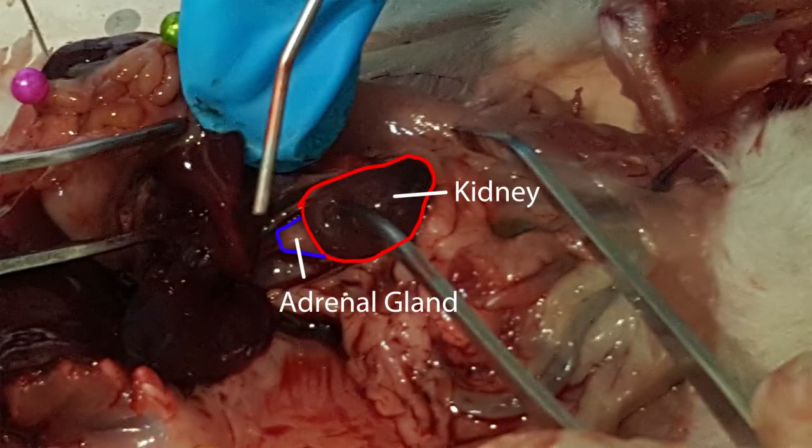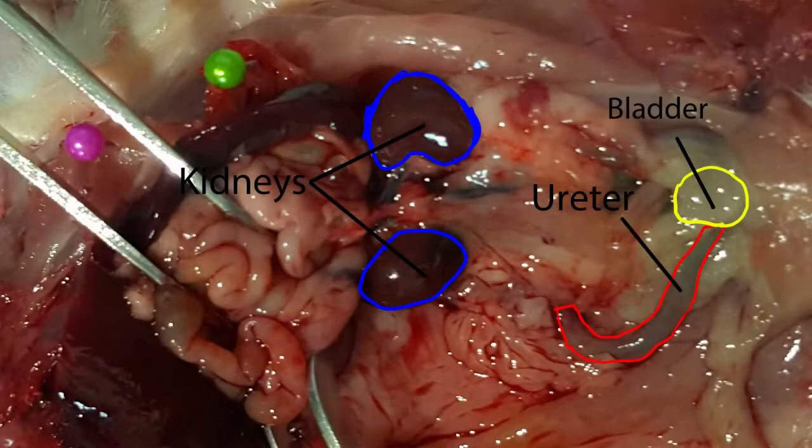Adrenal glands are the small yellow glands embedded in the fat on the top of the kidneys. They secrete adrenaline into the blood during times of stress. Ureters are the two thin tubes that are the passageway of urine from the kidneys to the bladder.